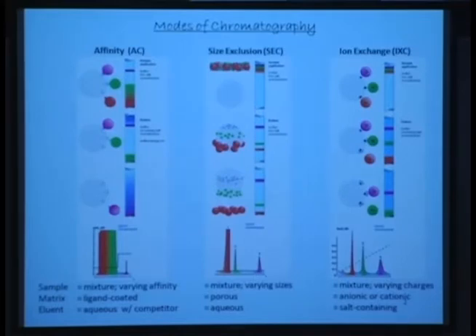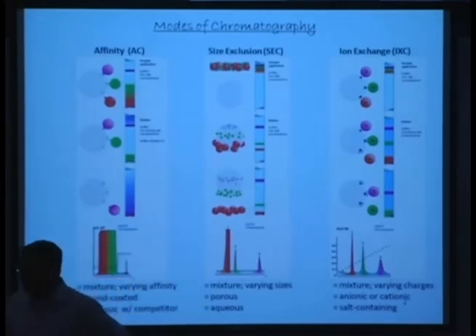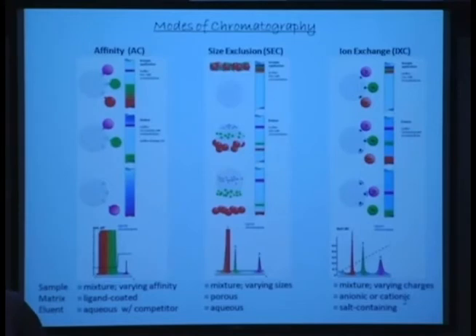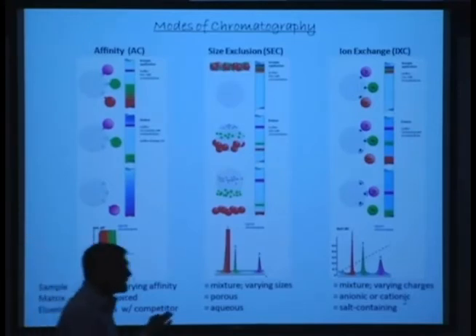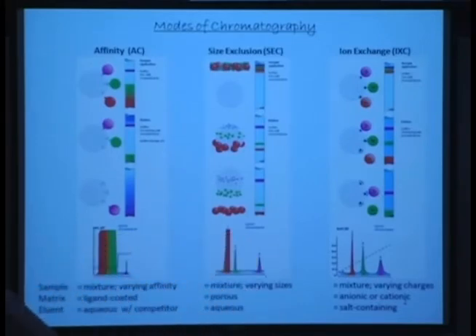Okay, can I go forward? Yeah? All right, let's talk about ion exchange. Okay, so one of the things that I completely forgot about is that here the matrix plays in essence no role other than sieving. The matrix doesn't play a role, and it would be difficult to find a matrix that has absolutely no interaction with molecules. Okay, you would have some interaction.